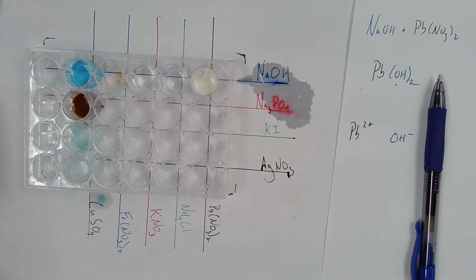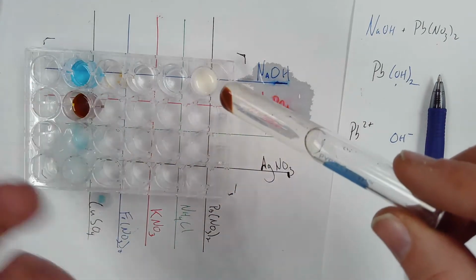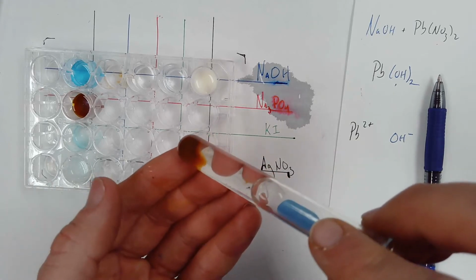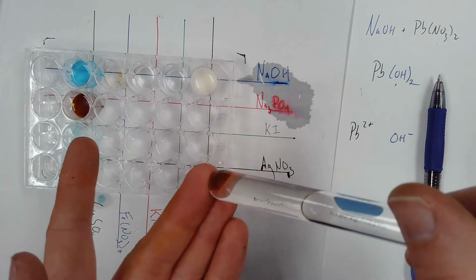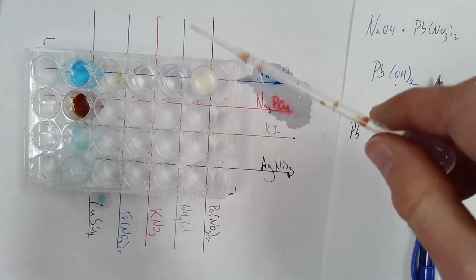Now, while we're here, let's go grab that out of the centrifuge. Right? Here's our iron hydroxide. You can see, again, it's separated out. Anytime I get a precipitate, I could spin it down and prove it's a solid like this. Right? If I want to separate. Now, I did add a little water to this just to make it more obvious of that separation, but it should be clear what's going on here.